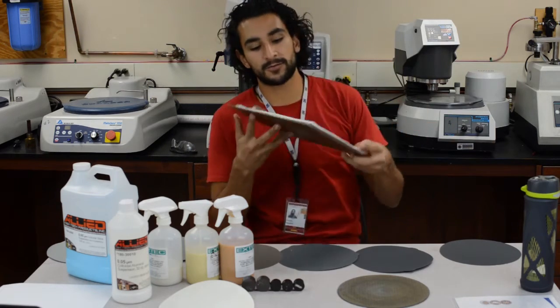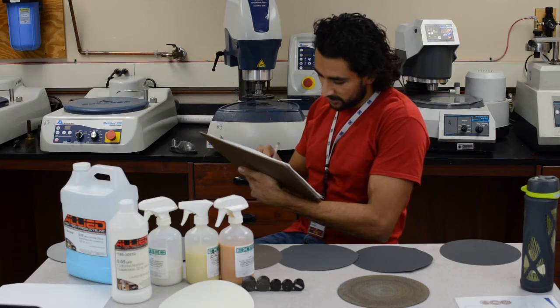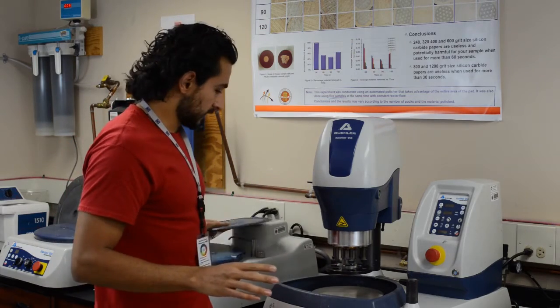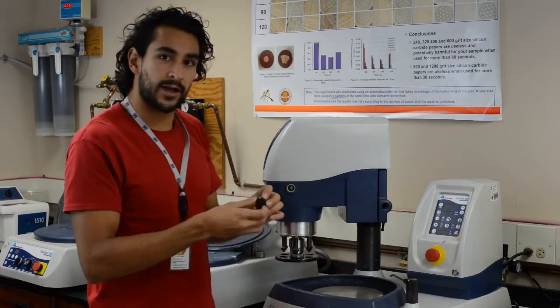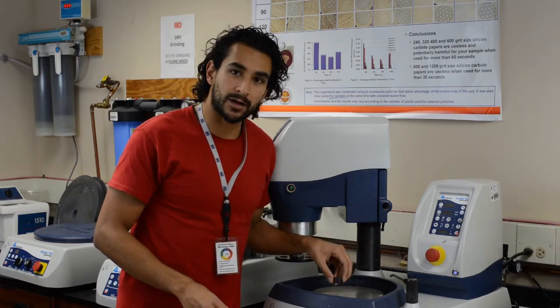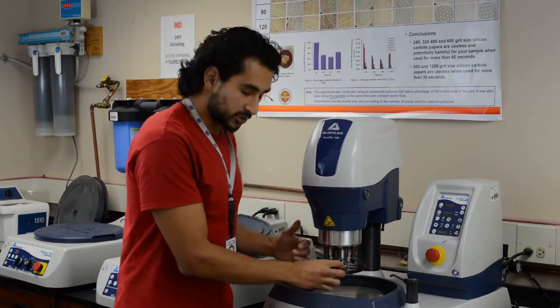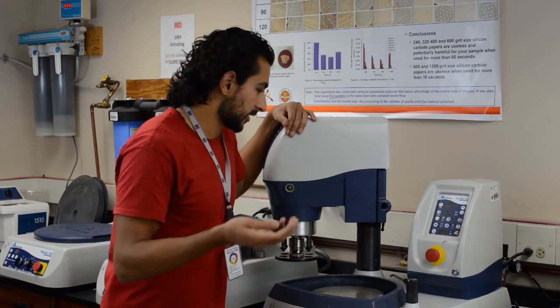Don't forget to log in before you use the machines. I'll be using polisher number three, which is an automated one. This is the machine we'll be using. The head moves so you can actually polish by hand — this plate rotates and you put your sample on top with a piece of sandpaper on the plate. But this machine has a head with fingers that come down and push on the sample, so it's semi-automated — but you still have to tell the machine what to do.